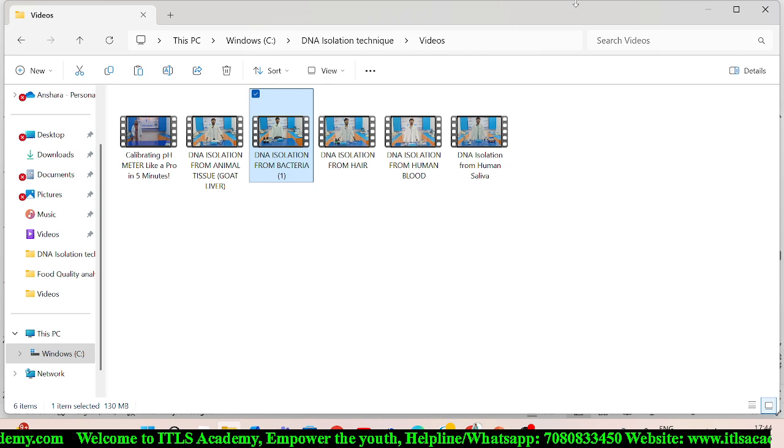and need to add lysis buffer drop by drop so that we can make the paste, because if we add the entire amount at one time it becomes a slurry, which we cannot further use for the experiment. That's why we need to make a paste and grind it properly. After grinding it properly, now we need to filter it out.